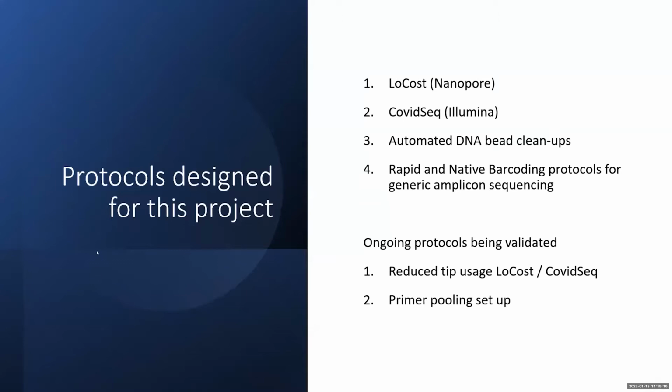So within this course and within the CADE project, I've designed several protocols, primarily for COVID-19 sequencing, both for nanopore and Illumina chemistry. As these are the most standardized protocols utilized for this. But within this as well, we've also designed some very generic DNA bead cleanups, as you would use for the Illumina sequencing protocol, as well as very standard rapid and native barcoding for nanopore technologies.